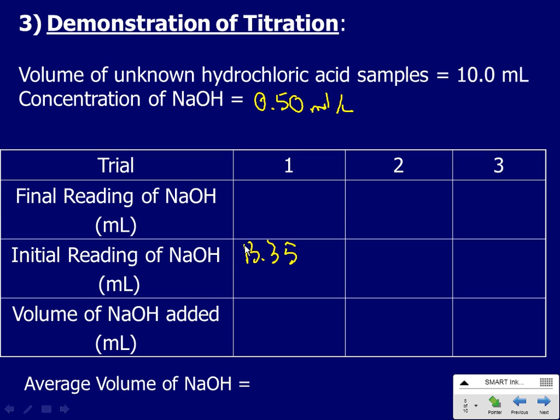Okay, so now I'm going to titrate, and again, 13. I should be at about 23. So let's start adding. There you can see the pink starting to hang around. See how the pink kind of hangs around and disappears? As I get closer, it hangs around longer. And at that point, you've got to be really patient. You've got to slow down how quickly you add it. Someone who titrates well is a very patient person. I'm not a good titrator, as you could probably imagine.